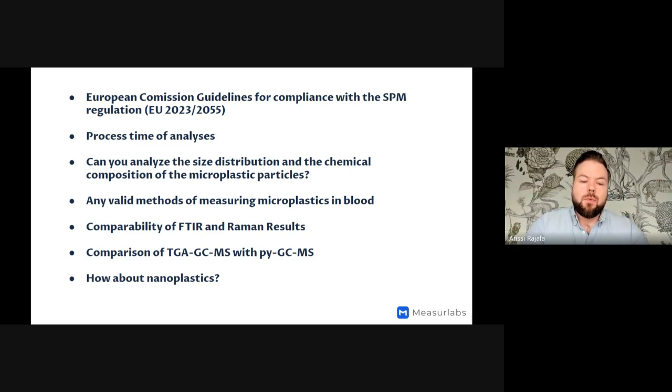If it's a cleaner one, I would recommend sending up to 1 liter, but usually 500 milliliters is enough. And usually this kind of analysis is carried out with a 100 milliliter subsample.